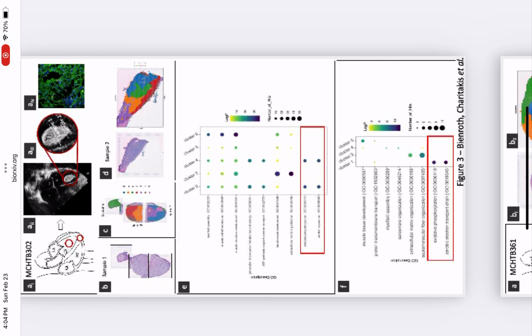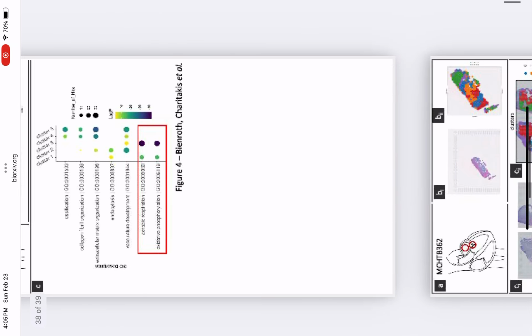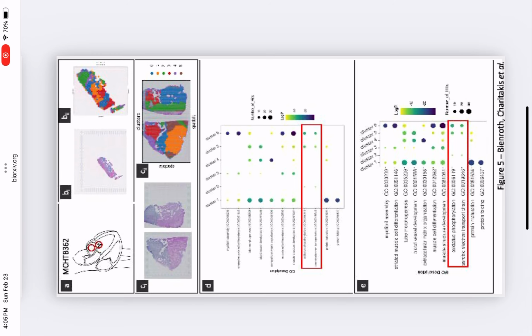Spatially variable genes, SVGs, crucial for understanding cell differentiation and tissue organization, are identified using SpatialDE for Visium data or Moran's I statistic for other data types, supplementary Figure 2c. These steps, selected to follow a typical workflow of a bioinformatician, ensure VR-Omics provides a complete experience for the analysis. Additional capabilities for Visium datasets include the option to concatenate multiple sections from the same tissue in 2D for downstream joint analysis, supplementary Figure 2e, and the exploration of clustering results using the Leiden algorithm or Stargate for more complex analyses.